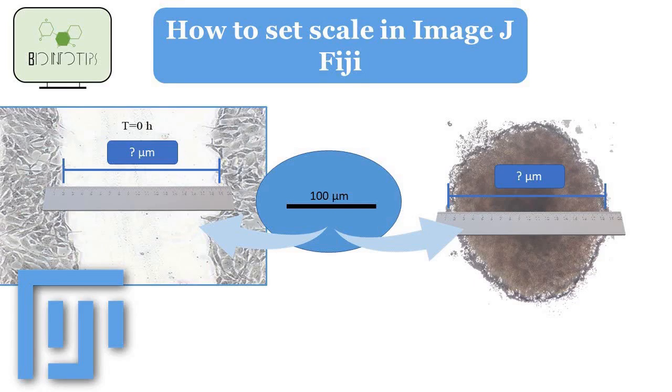Hello and welcome to this ImageJ tutorial. In this video, I'm going to show you how to define the scale in ImageJ.